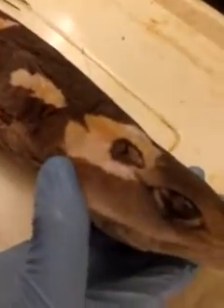Next, we have the preorbitalis, which we also didn't uncover, but that's right in this area. And the origin is the ventral chondrocranium. The insertion is the Meckel's cartilage. And the homologous structure is the adductor mandibulae anterior and externus.